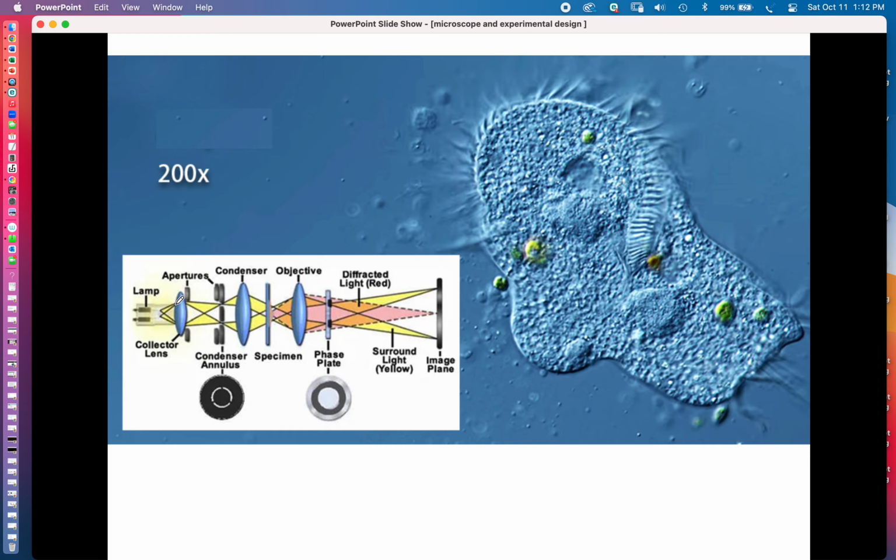And so here is just the light source, and it comes up through here. And this is that block. And there's a disk like this right here that would be similar to the dark field disk, but it's not as big around. But if you look down at it, if you could see it through the microscope, it's a dark ring like that. And then there's a ring of light.